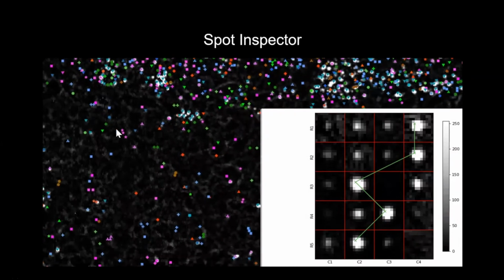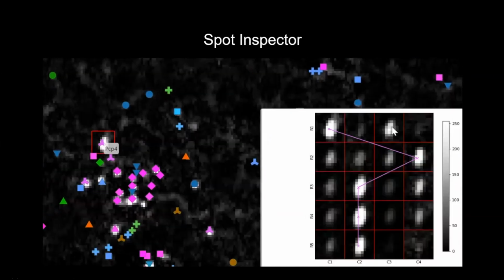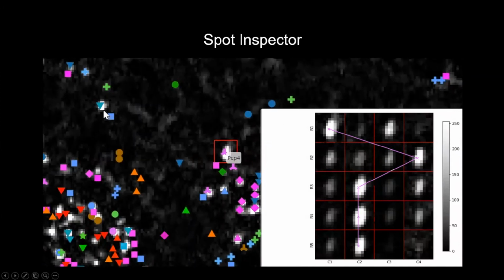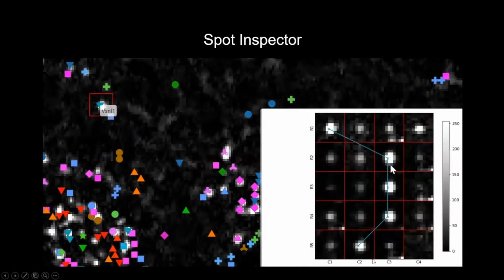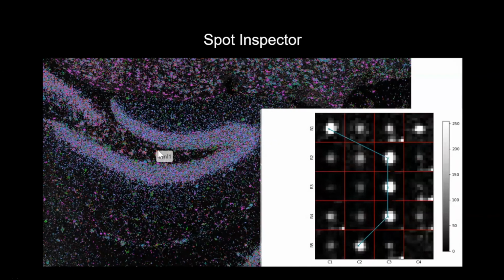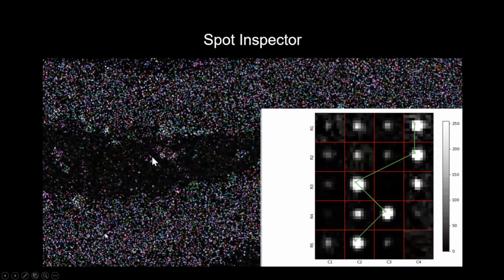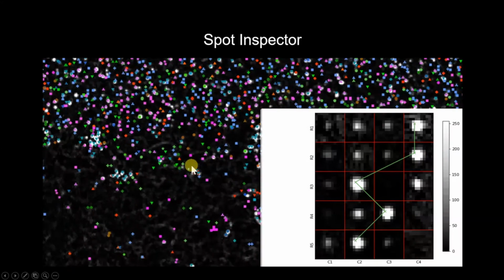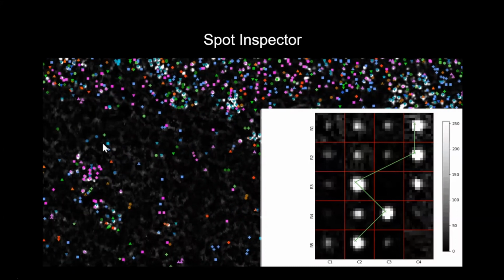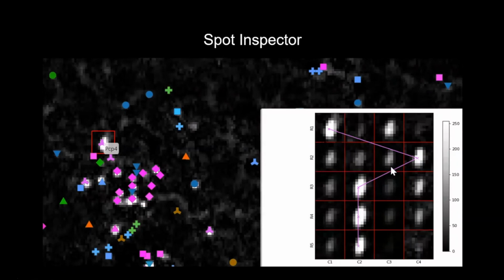So this is very practical for quality control when you do decoding of data from multiple rounds and channels, because it's very difficult to see. Here we have 20 different images on the same point, and it's difficult to see the 20 images at once when you have that amount of data on the whole raw data. So that we will do actually during the lab today or tomorrow, depending on how fast we go in the lab.